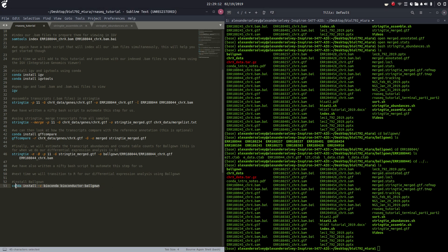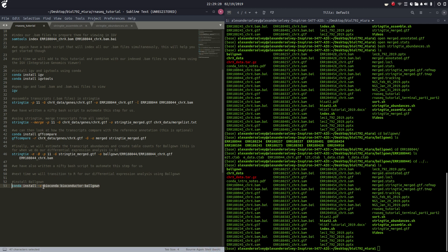Now I'd like to talk about installing Ballgown using conda. This was not as intuitive as conda install ballgown. Bioconductor is a bioinformatics repository for R. It has a bunch of different R programs as well as different things that you'll need to run these packages in R.